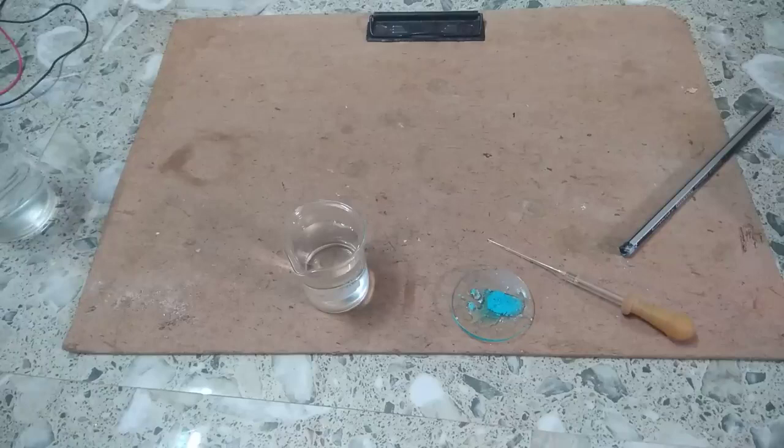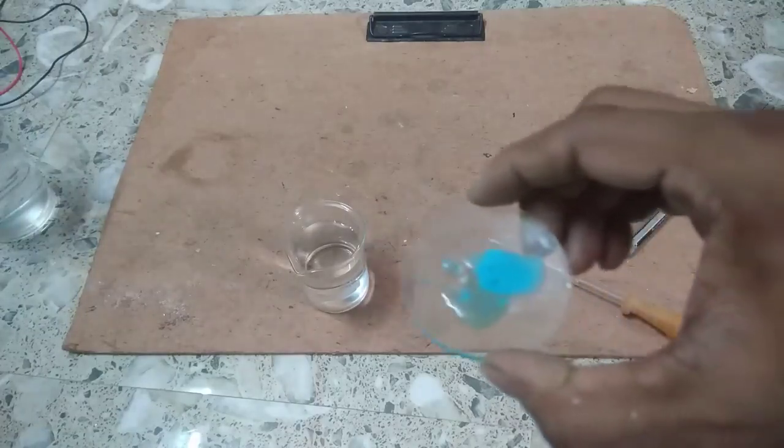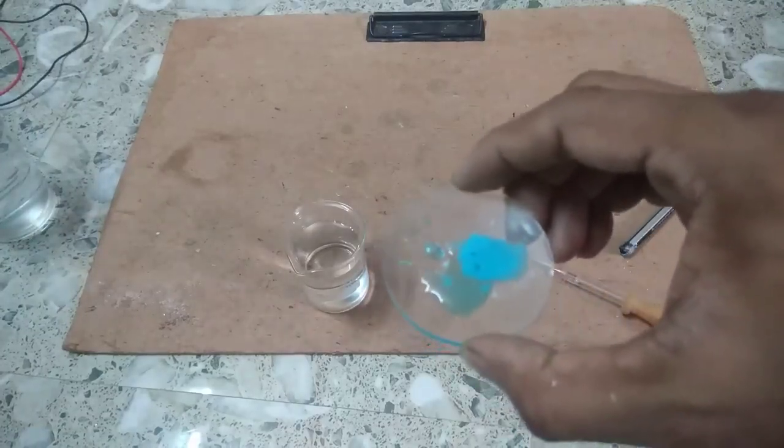When you heat hydrated copper sulfate, it loses its water of crystallization and changes into white. And when you put water again into the anhydrous white copper sulfate, it changes into blue color. That means it is a chemical change and it is a reversible change also. First the copper sulfate was blue and at the end we also get blue copper sulfate. Therefore, you can say that it is a reversible chemical change.